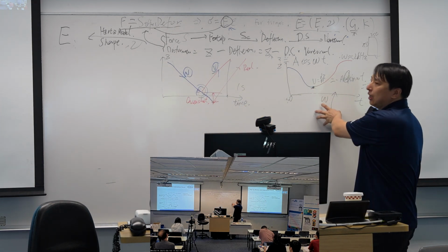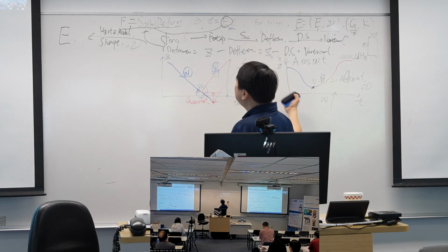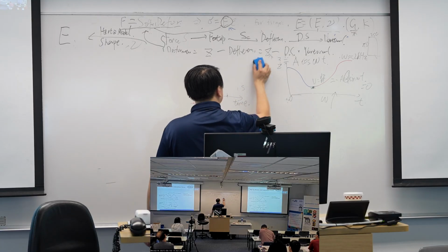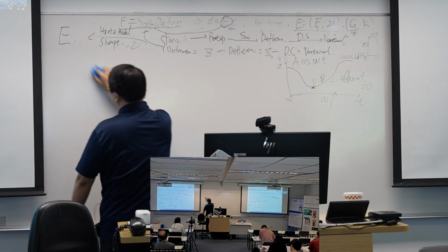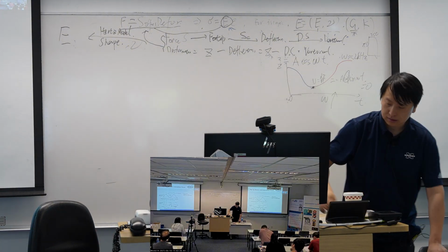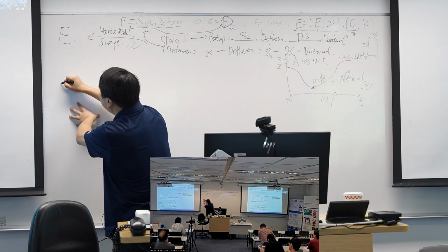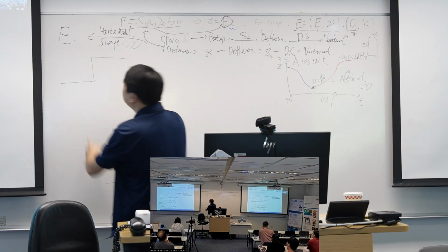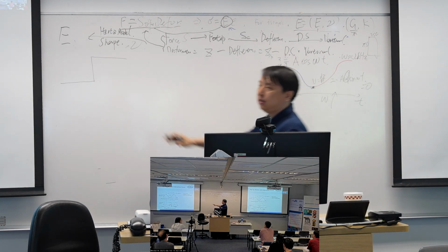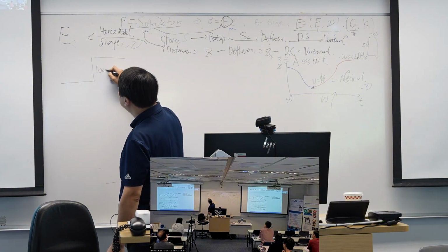Now with this setup, we may continue to how to use it to help us do the imaging. Okay, so let's think about we have a sample. We are doing a step sample. The step height, we set it to be 100 nanometers.